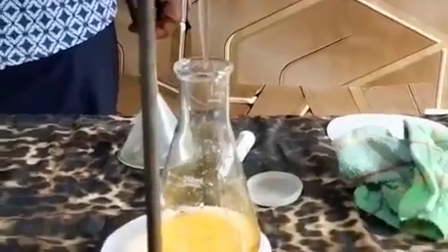So you're going drop by drop, and then you have to be ready for action so that when you notice a color change, you close the tap. So that's the way it's being done. The color is changing gradually. So we'll close the tap. So let's shake it and see what has happened.